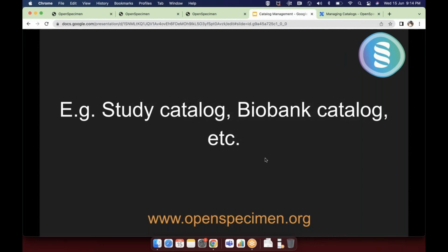This might be useful for the public catalog, where you give very high level summary data. So even those things are possible, and if there are some things that are not possible, and you're looking for such things, you can contact us if you need some specific enhancements.